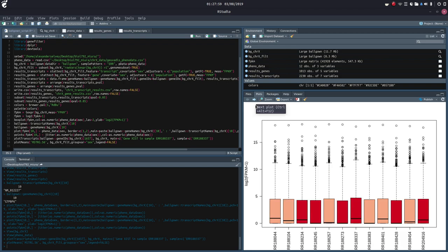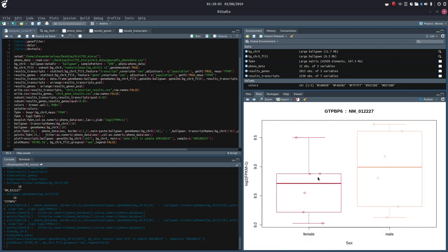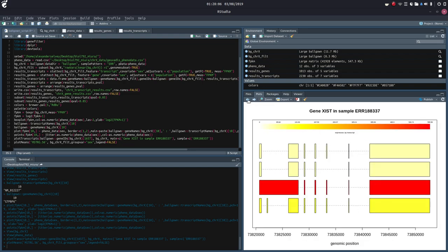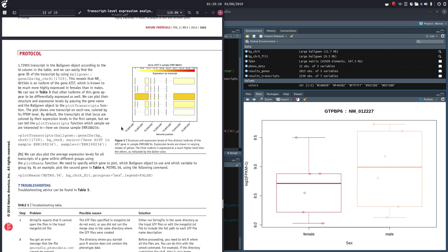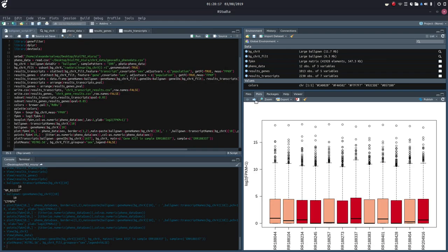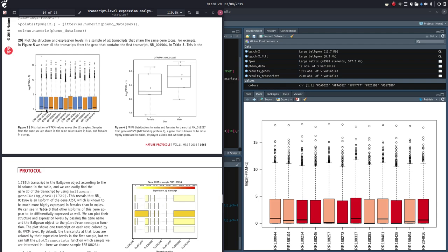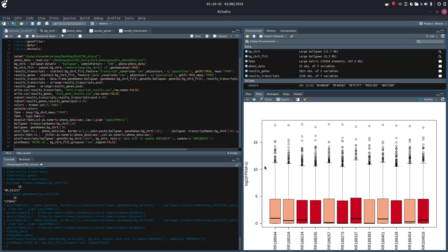If you have any ideas of why the fifth isoform disappeared or why our boxplot looks a little different, hit me in the comments below. I know that not everything is a perfect science — this one looked exactly the same, but this one and this one were a little bit different. If you have any ideas why, this should be a pretty reproducible protocol. We got some good mean bars here with pretty good outliers. I can't really think of anything — maybe it was because of StringTie and how it compiled using 11 threads versus 8. Maybe if I go back and do 8 threads I'll get the exact same graphs.